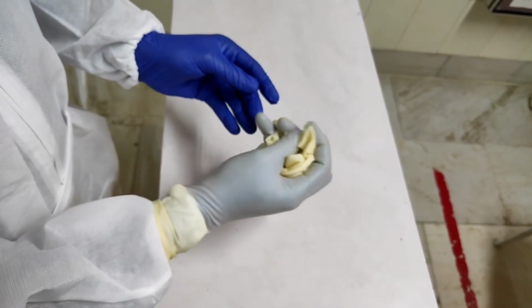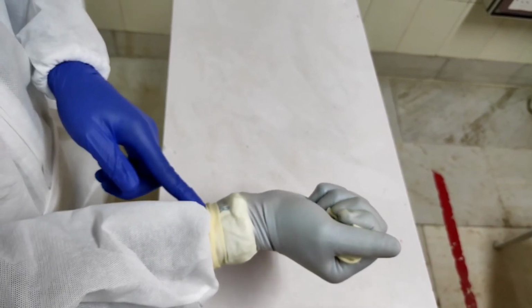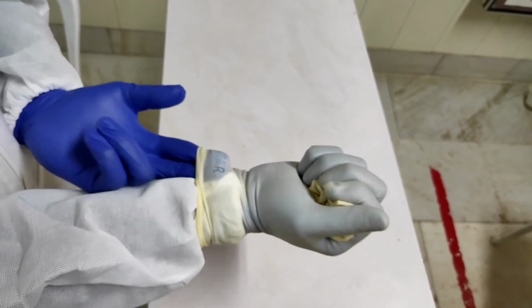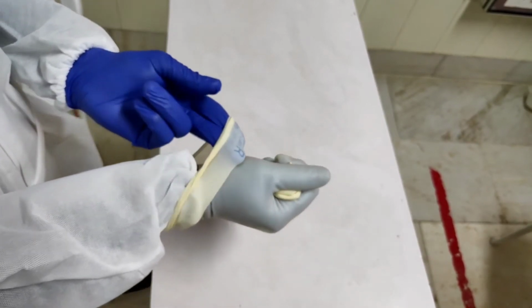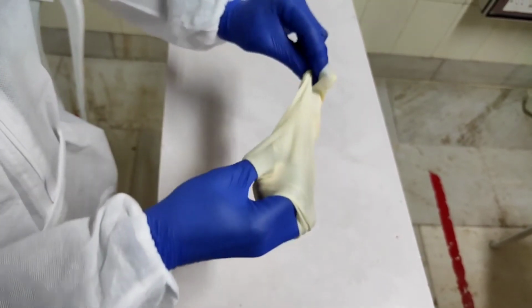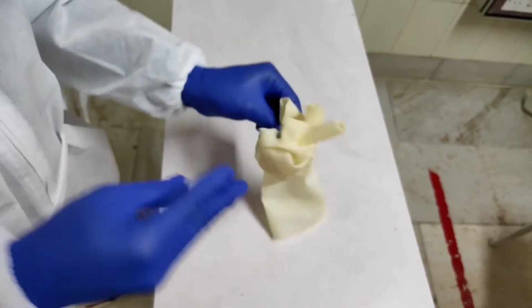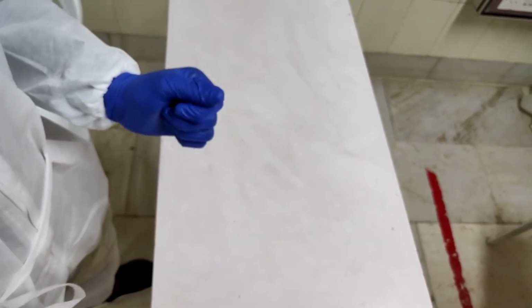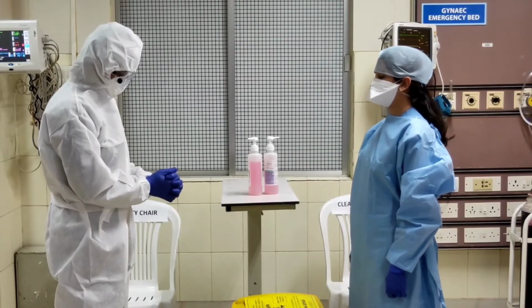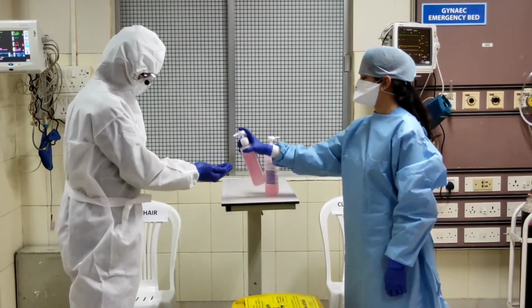Once removed, make it into a ball with the palm of the other hand, and then to remove the other glove, slowly insert one finger into the inner aspect of the glove and, like earlier, slowly pull it out. And once pulled out, the glove should form into a ball with the inner portion of the glove now facing outward. After discarding the outer gloves, you have to disinfect your inner gloves.